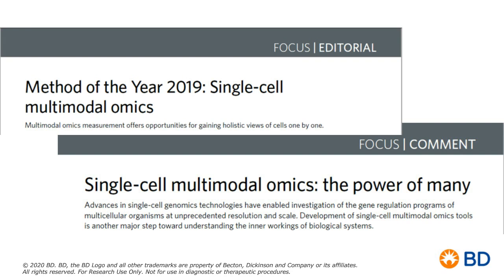But essentially, it provides a means to determine your viability, your cell capture rate, how many multiplets you may have, how many single cells are associated with a barcoded bead, things of that nature. So it's a really nice way to have some upfront confidence in what's ultimately going into the sequencing. All right, very good. Thanks, Joe.